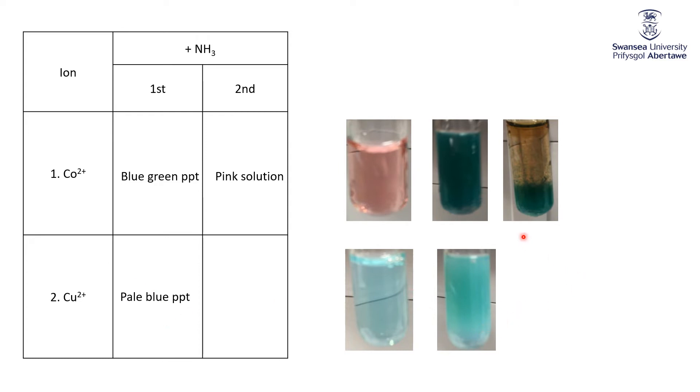Keep adding ammonia to it, though, and you get this glorious deep blue precipitate formed. Excuse me, deep blue solution formed. Again, it dissolves up that precipitate. I've left a bit of the precipitate there at the bottom, you can see. But the bulk of the precipitate has dissolved back again as the ammonia acts as a ligand. Here it's a base. Further ammonia acts as a ligand.